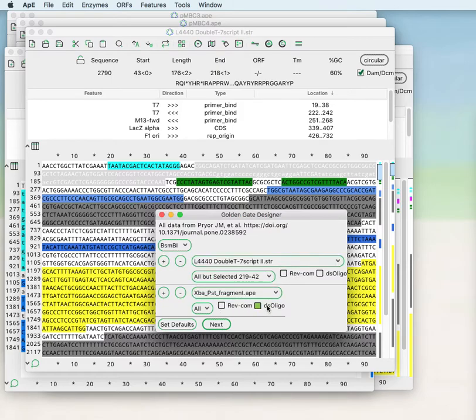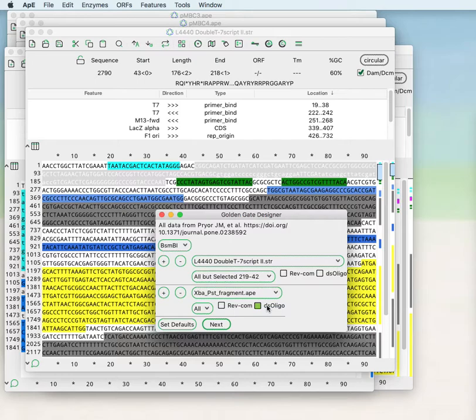At any time you can choose to reverse complement any of these fragments and if the fragment is short enough you can choose to have the designer design it not as a PCR reaction with designing PCR primers but instead to design it as two single-stranded oligos that can be annealed together to generate the proper single-stranded overhangs to ligate into the Golden Gate reaction.